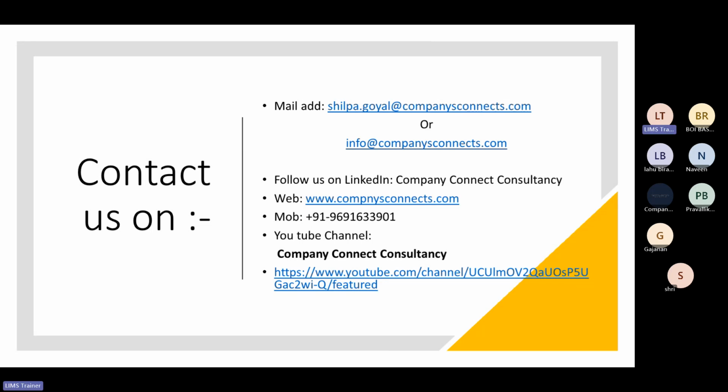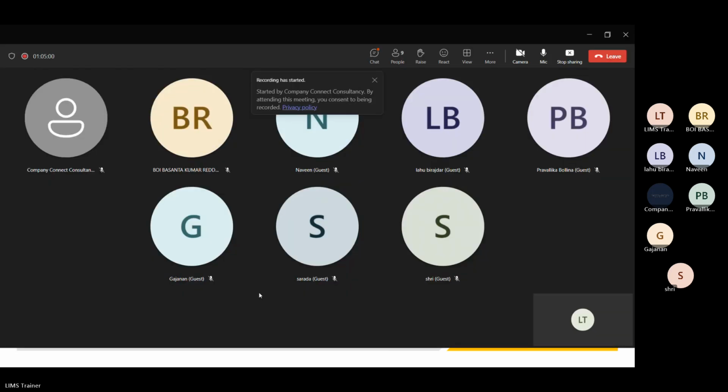Yes. Any questions here about the course, about the content, or about anything that is in your mind? Yeah, please. Yes, I have one question here. Whatever slides you have shown here, once we opt for a course, will you be doing the exercise in the real application, or will it be a screenshot based concept? Clarification, how is it going to happen?